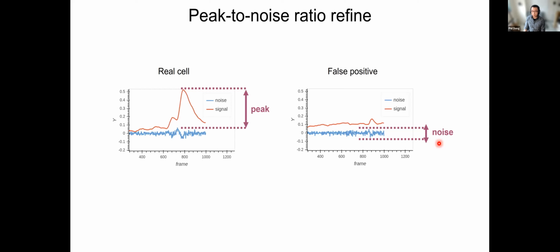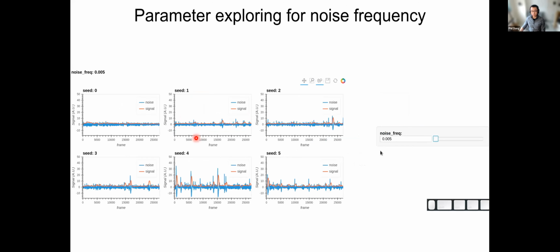As you can imagine, in order for this step to work properly, it's really critical to define the correct cutoff frequency to separate the low frequency and high frequency components. Here is a Minian visualization that helps you determine a proper cutoff frequency to set. We have the temporal activity of 6 randomly selected seeds plotted here. They are all broken down into the high frequency and low frequency components. We're just going to call them signal and noise for now.